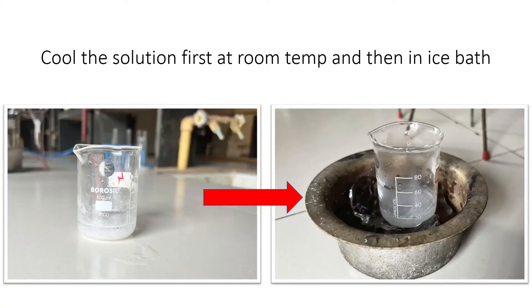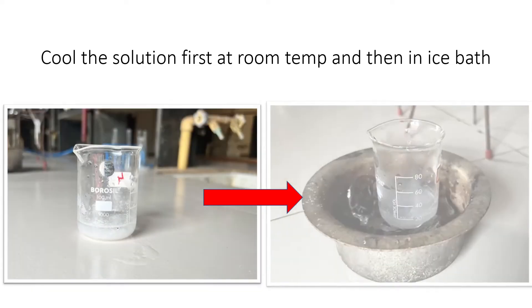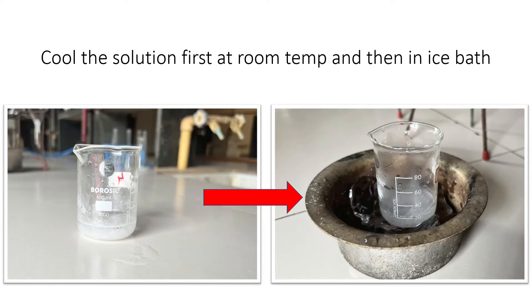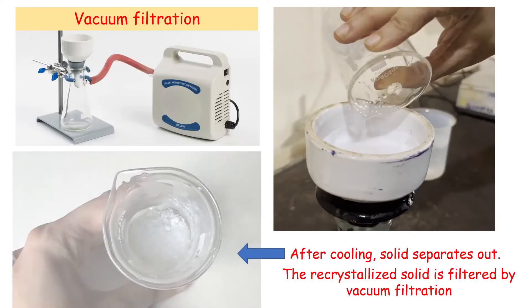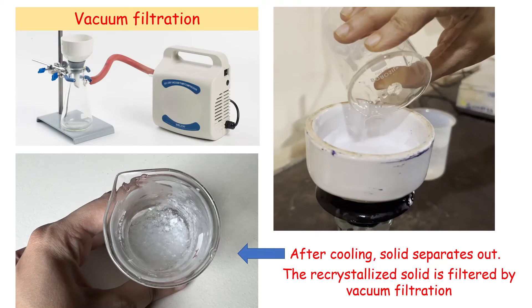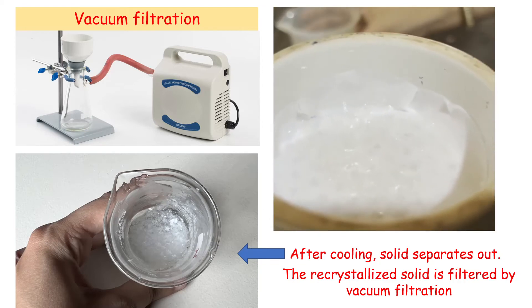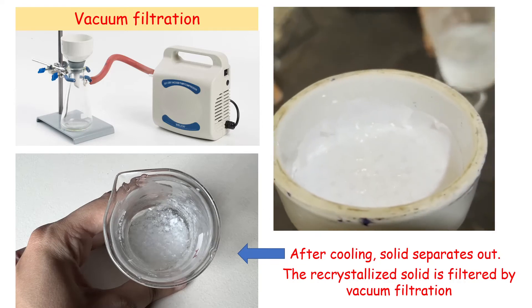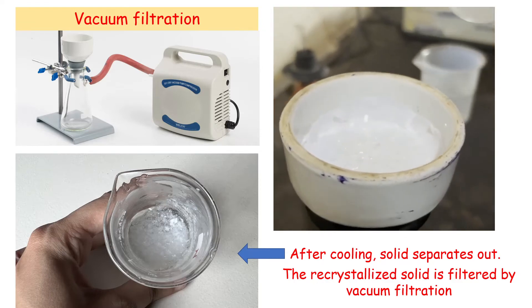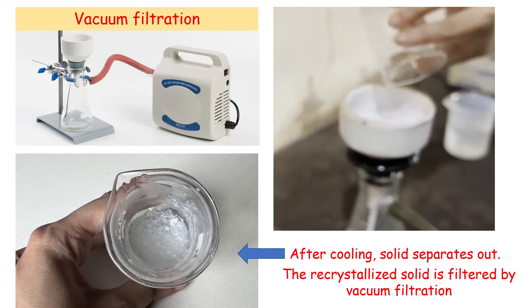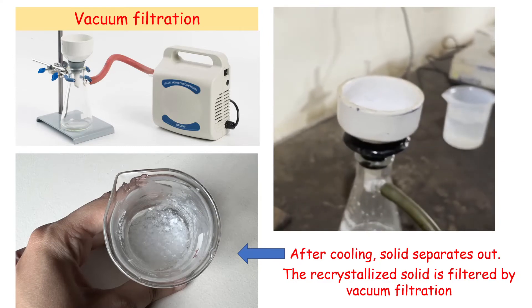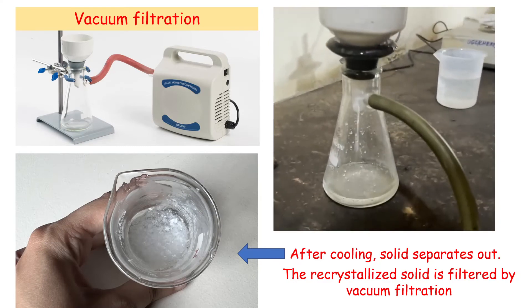Now we will cool this solution in a beaker, first at room temperature and then in an ice bath. After cooling, solid separates out. We will filter the solid using vacuum filtration, and you will get all the separated solid.